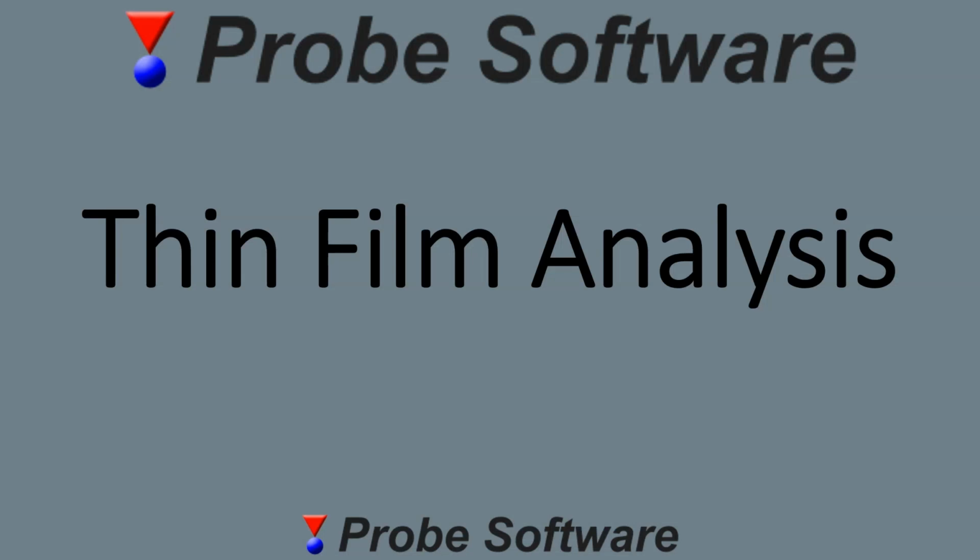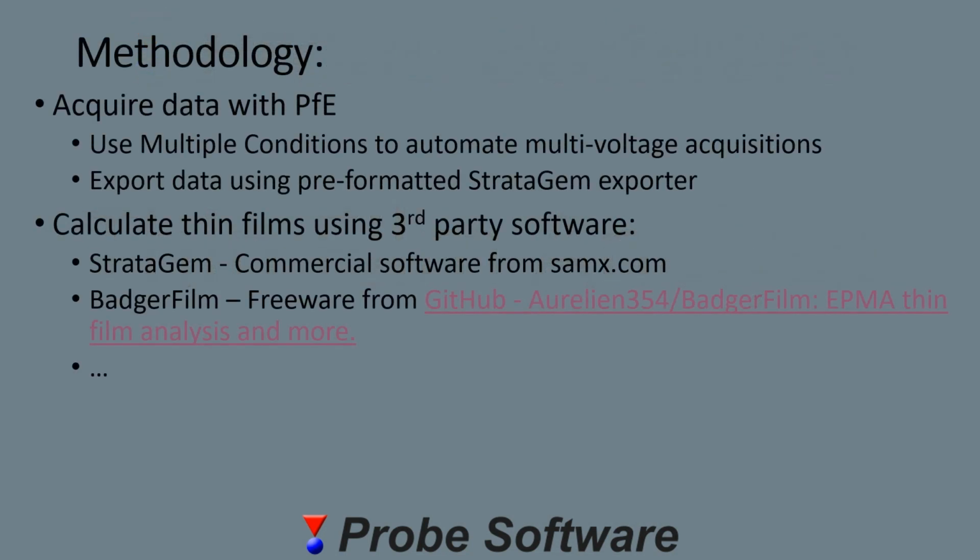One of the more advanced modes that Probe for EPMA gives easy access to is thin film analysis. Firstly, it allows you to easily set multiple conditions to fully automate multi-voltage acquisitions. It also provides an easy way of exporting the data pre-formatted to a STRATAGem format.